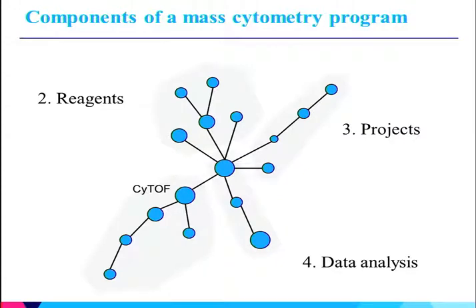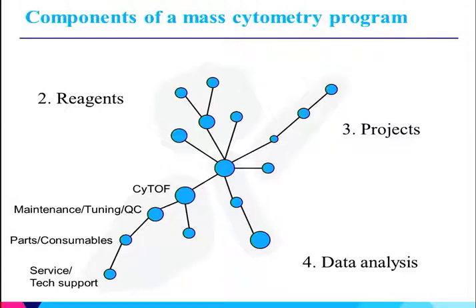So considering the instrument first, you have the CyTOF, of course, which is the center of the whole program. But the CyTOF itself is a very sensitive device, and its performance and the data you get from it is highly related to a really strong program of maintenance and tuning and quality control. And in order to do this, you also have to have parts and consumables to support that element of things, and a good relationship with tech support at DVS, because you need them.